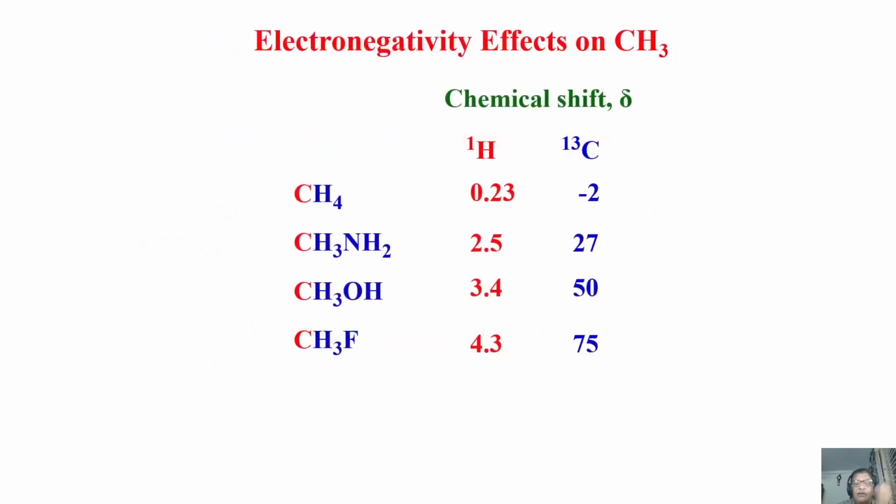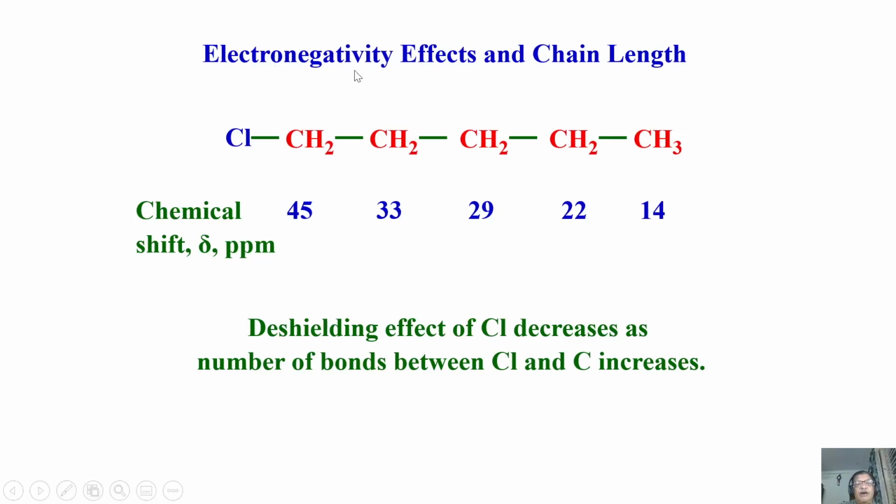Okay. Again we saw what happens as the chain length increases. We saw the induction effect when they substitute an electronegative atom, and how it affects the shift. We saw that in proton also. Now a long chain molecule is taken, a hypothetical molecule. Don't worry what is attached or anything. One of the protons is replaced by a chlorine here.